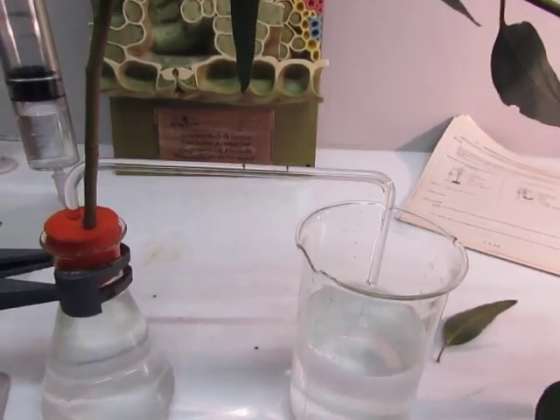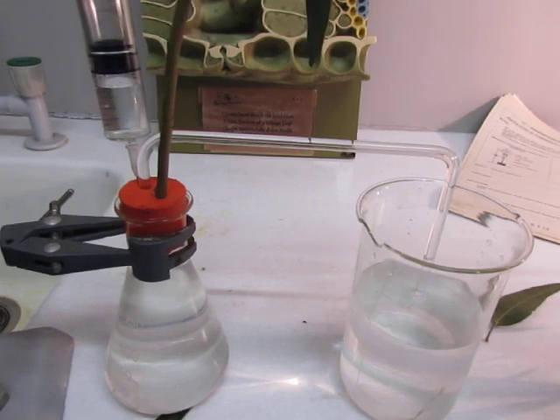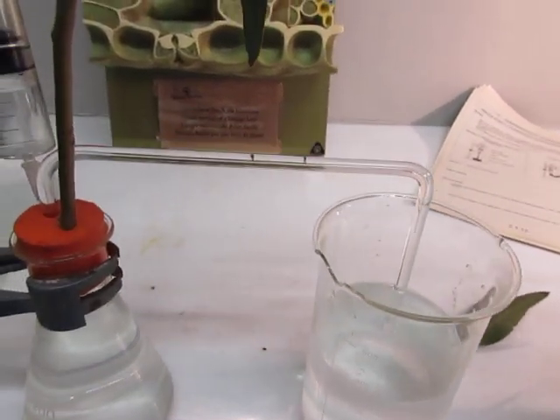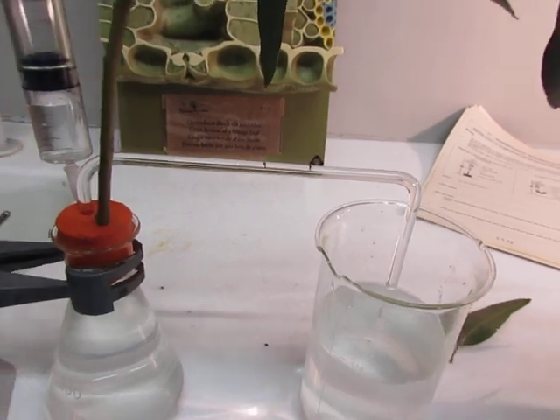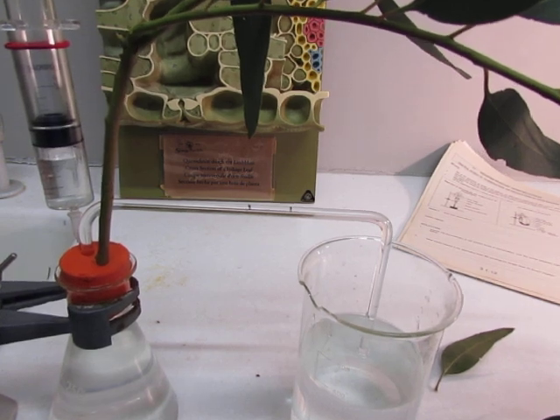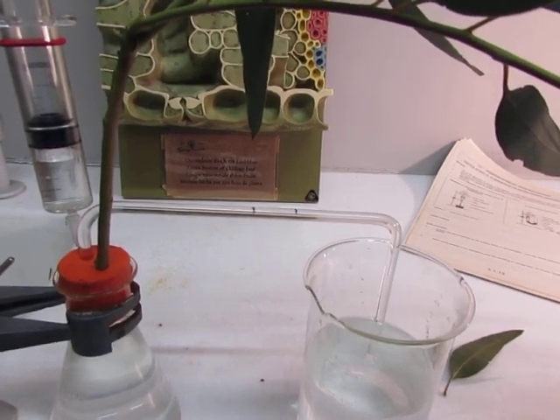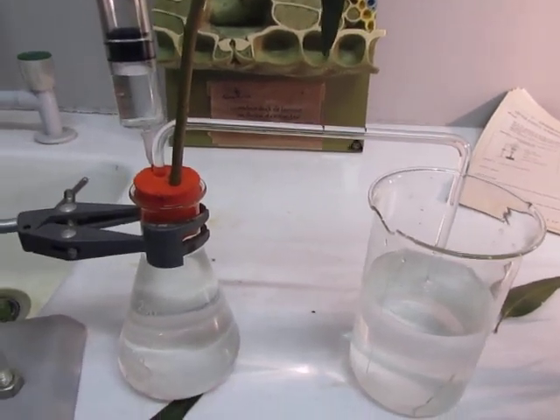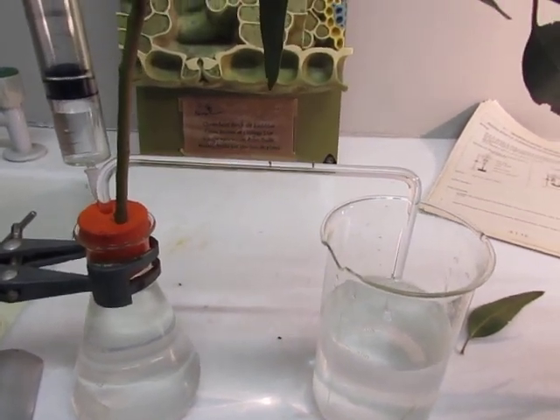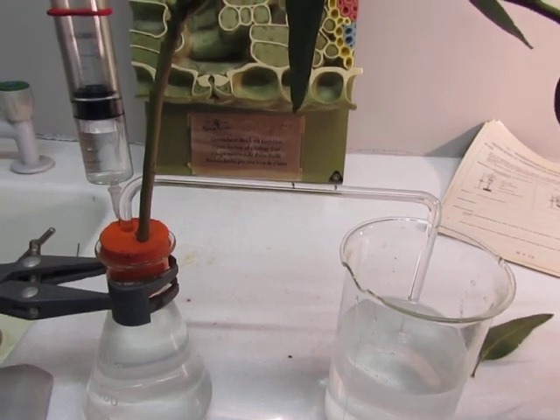Now you see it's back to the first mark, and I reset and press start again. You see I've leaned a bit forward, so I have to stop it, reset it, and start the measurement again. And now it's moving nicely.